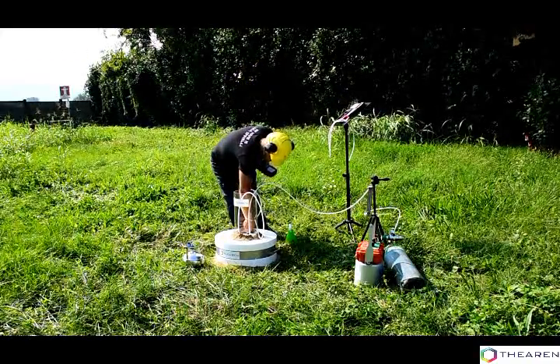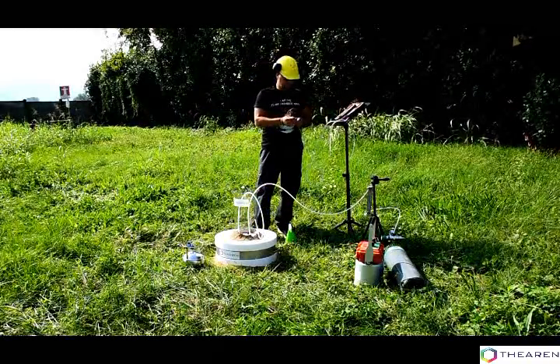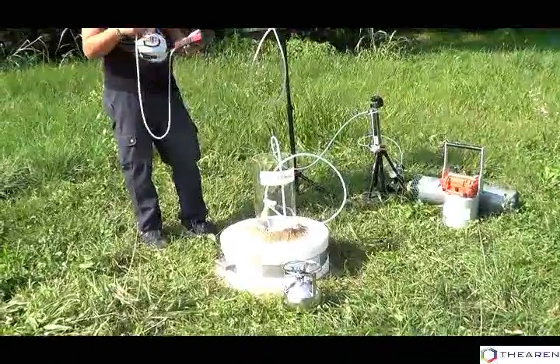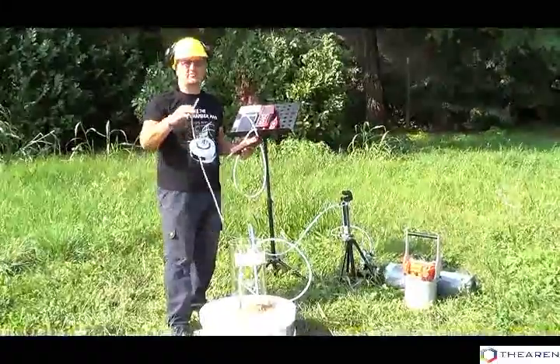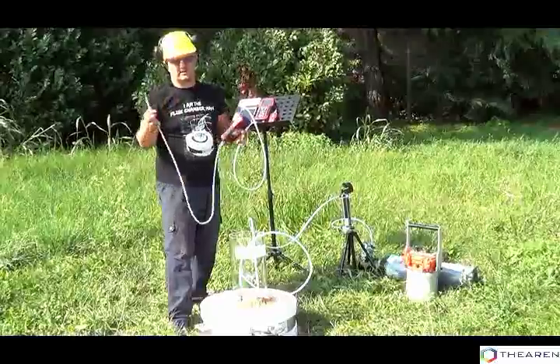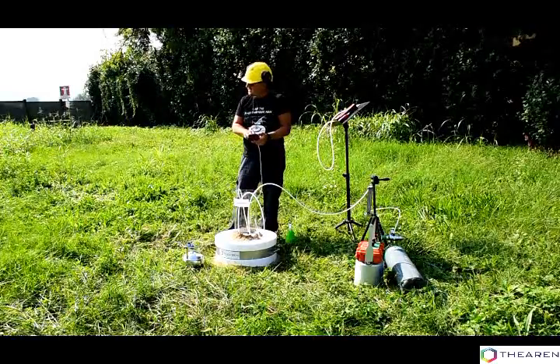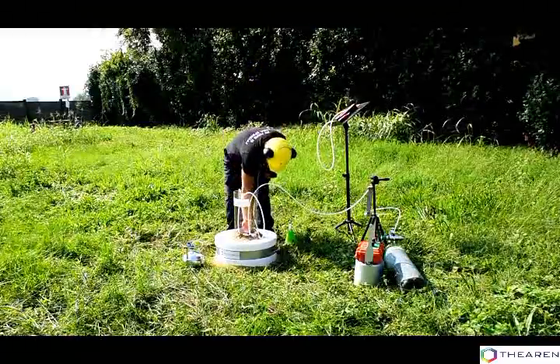During the purge, the measurement must be made every residence time, while during sampling at least once an hour. The sampling time is normally never less than 4 hours, normally 6 hours. The parameters that must be measured are oxygen, carbon dioxide, methane, and VOC with PID inside the chamber. Then, delta P measurement is very important to verify that there's no intrusion of external air and the system is well controlled.